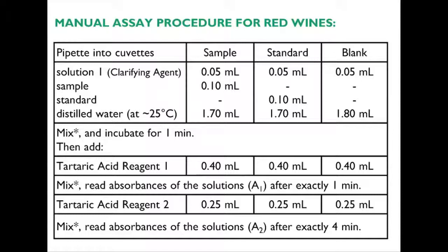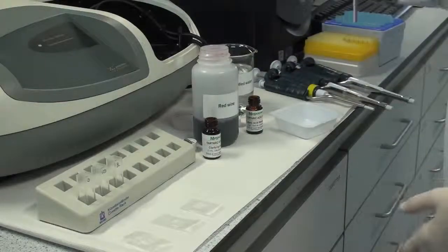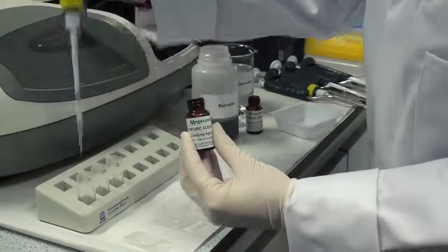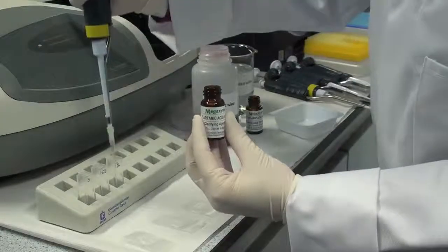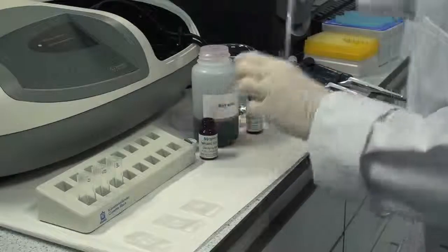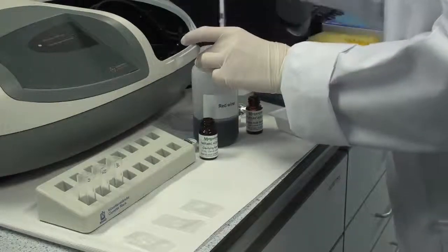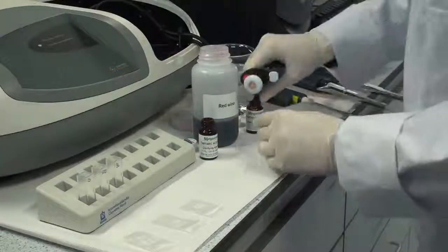This manual assay procedure is specific for red wine samples. The conditions of this procedure are identical to the general assay procedure except with the addition of the clarifying agent. Each batch of samples requires a standard and a blank. Pipette 0.05 millilitres of clarifying agent into the sample cuvette, standard cuvette, and blank cuvette. Then add 0.1 millilitres of sample into the sample cuvette and 0.1 millilitres of Tartaric Acid Standard to the standard cuvette.